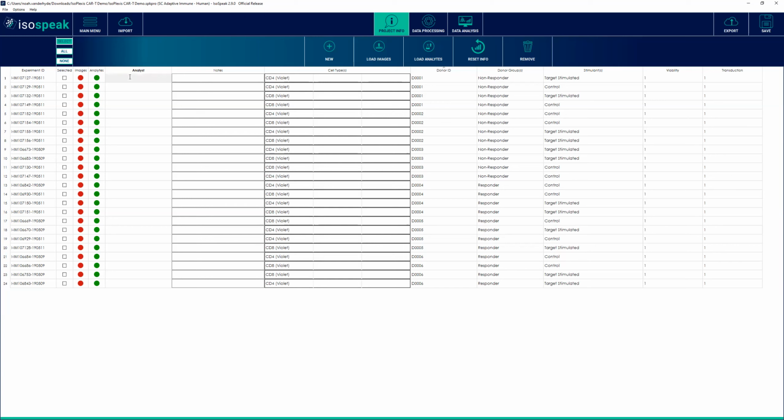If you or one of your lab members, or several of your lab members, have been working on the assays at a time, you can type in who specifically did the assay. So I can type in my initials here, NSV, and I can type in Brad's, BA. So you can really get to see who was doing those experiments. From there, if there's any notes, such as the viability dropping or a couple of key things about the biology that you need to put in, we have a notes text field here that's easy to use.